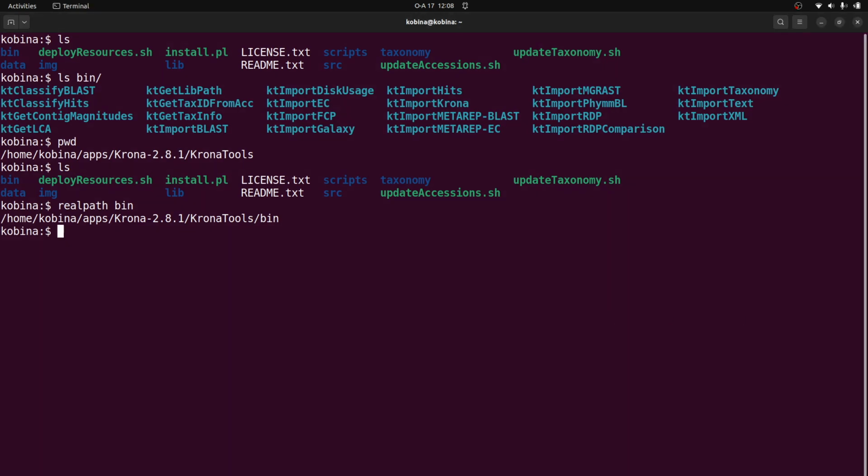So what we will do now is to do that basically. So make sure to take note of this path. Make sure to copy whatever you see. Yours is likely to be different, so make sure to copy this path that you have. So copy it first, we will use it later.